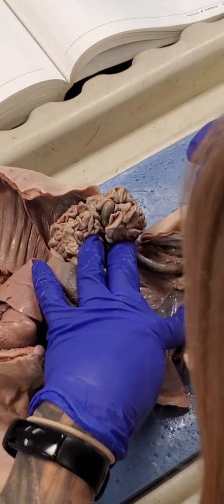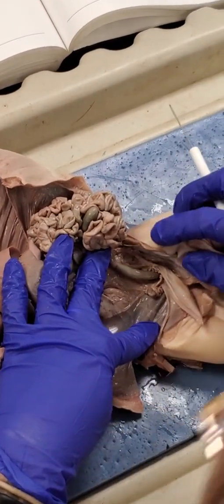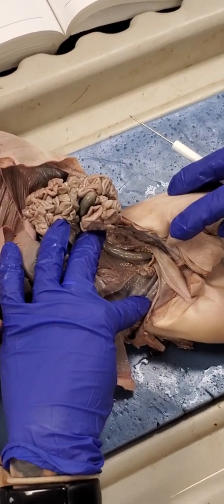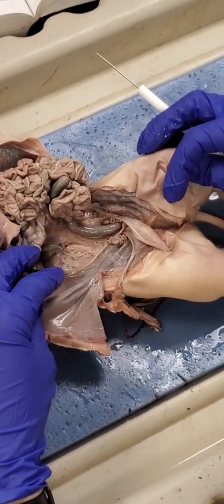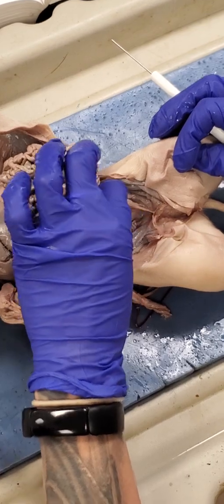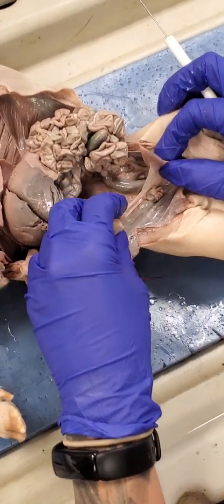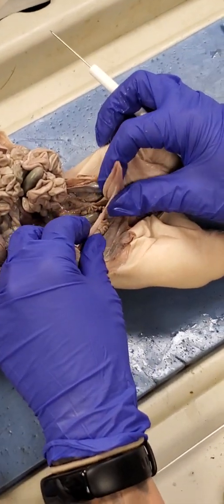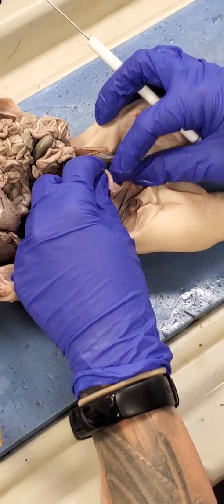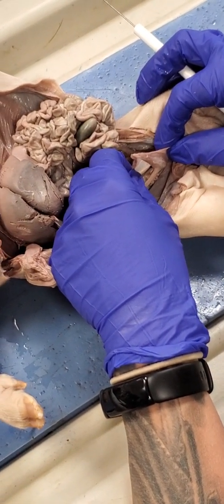Okay. So then with that, we go to our bladder, which let's double check on here really quick. So the urinary bladder, right? That one was kind of weird. And I want to say that we called it this thing, even though I wasn't quite sure. I don't know if you guys want to check it, but it wasn't very filled in this one. It wasn't as expanded as I would think. It's that white thing in the middle.